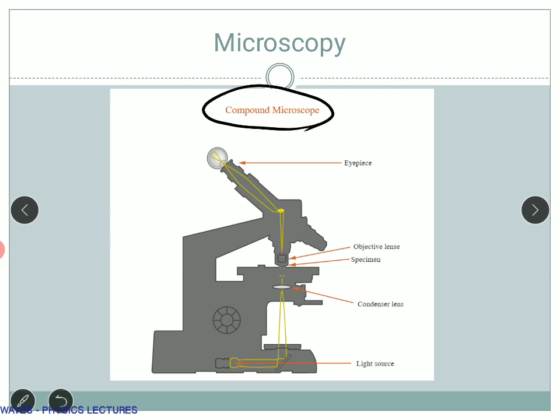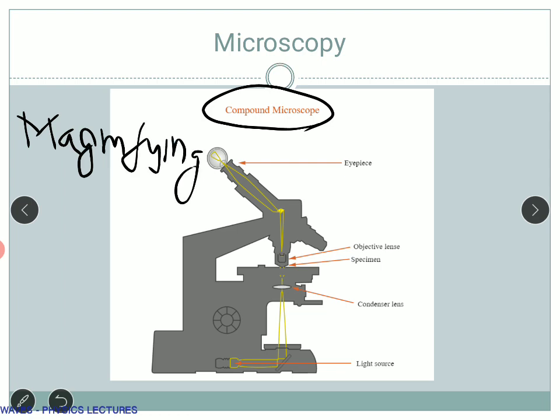as a compound microscope. But before that, even during your school time, you might have seen something which we call the magnifying glass. A magnifying glass is basically one kind of microscope, because whatever you look at under a magnifying glass is going to look enlarged, and this uses just a single lens. So this is an example of a very simple microscope.